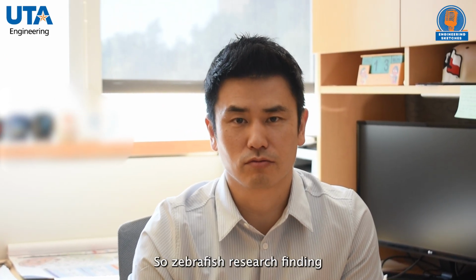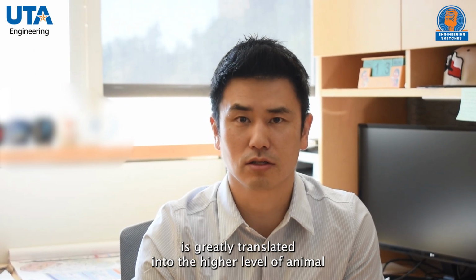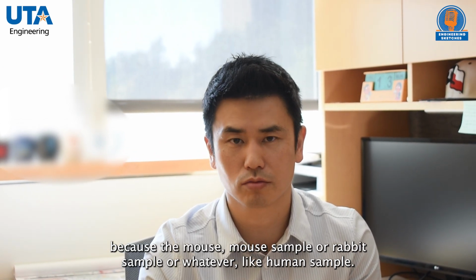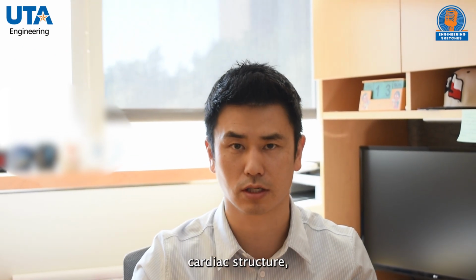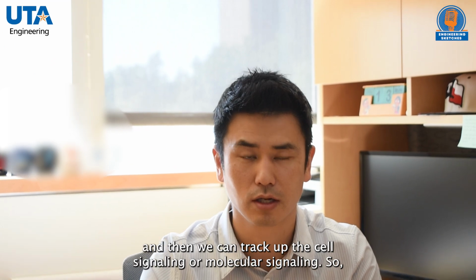Zebrafish research findings translate greatly to higher-level animals, because with mouse, rabbit, or human samples, we cannot see through, right? But with zebrafish and the microscope system, we can see through the heart, the cardiac structure, and then we can track the cell signaling or molecular signaling.